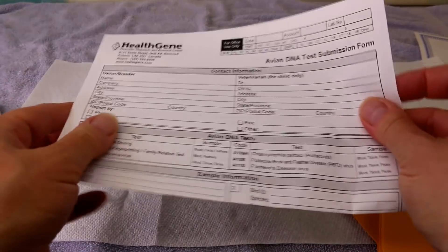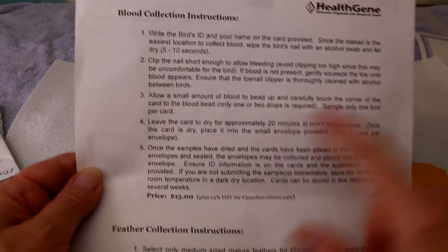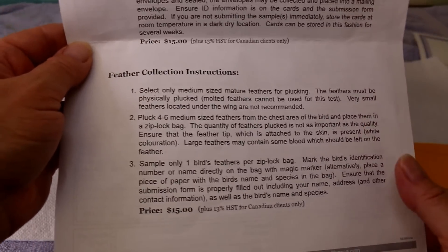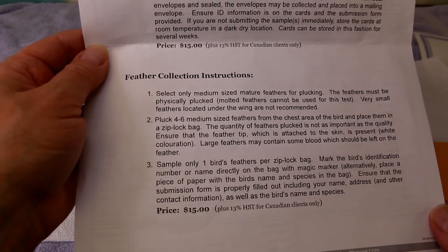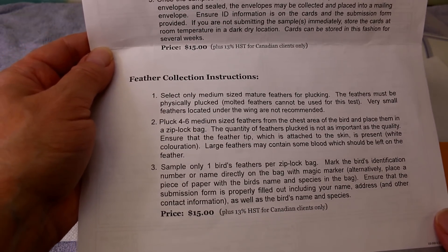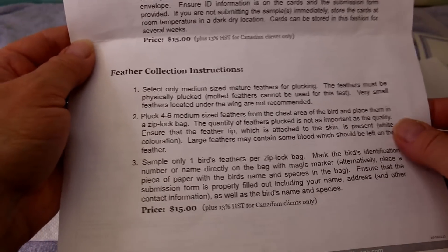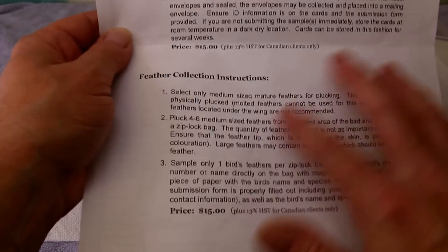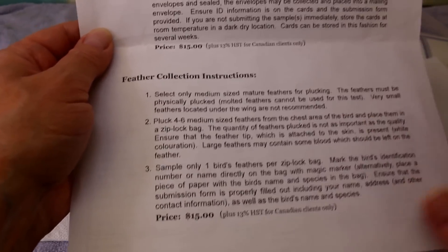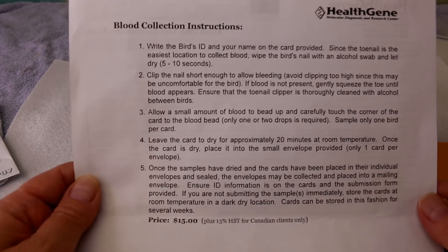It comes with an information sheet with instructions — this is how to take blood from the nail, and this is how to do feather collection. For feather collection, you have to pluck some feathers from the chest, making sure the feather tip is there — it'll be a white or yellow coloration. You can't use molted feathers; you have to pull them out because that's how they get the DNA from the tip. There's also a blood card — you put the blood on it and send it off. Make sure you label the bag.